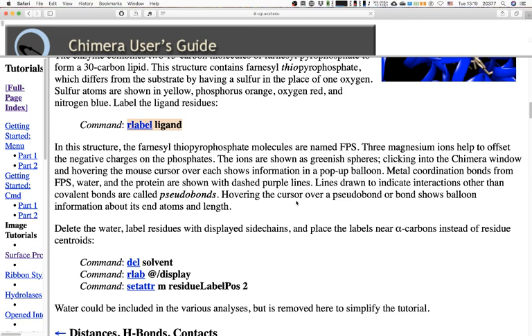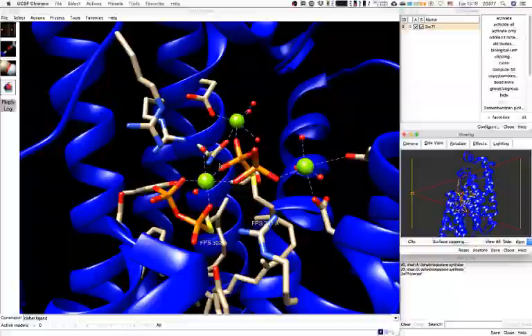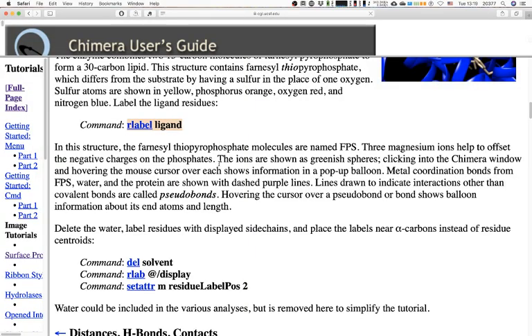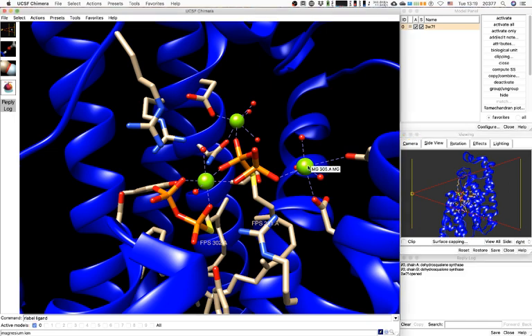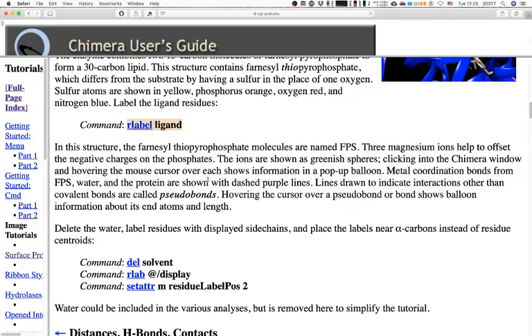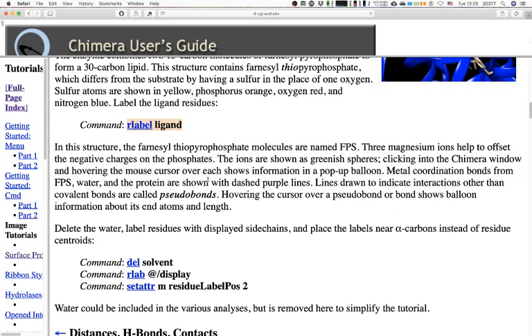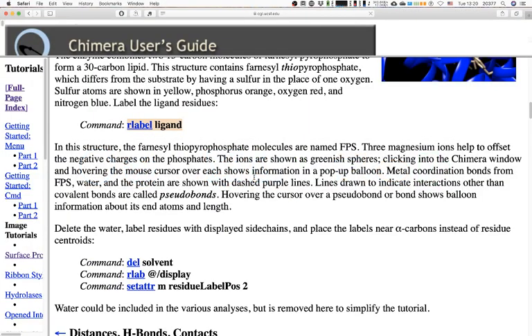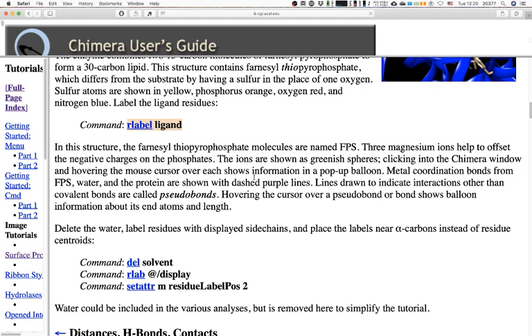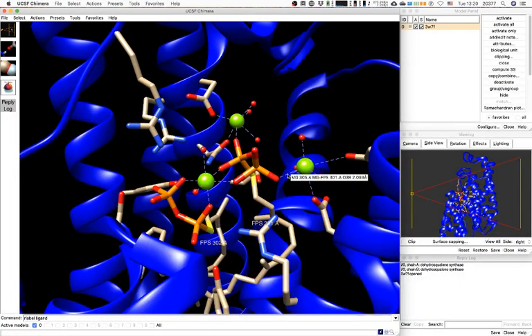Three magnesium ions help to offset the negative charge of the phosphates — we can see them right there as greenish spheres. Clicking into the Chimera window and hovering the mouse over the atoms will show information about those ions. Metal coordination bonds from FPS, water, and the proteins are shown as dashed purple lines. Lines drawn to indicate interactions other than covalent bonds are called pseudobonds. Hovering the cursor over a pseudobond shows balloon information about its end atoms and length.